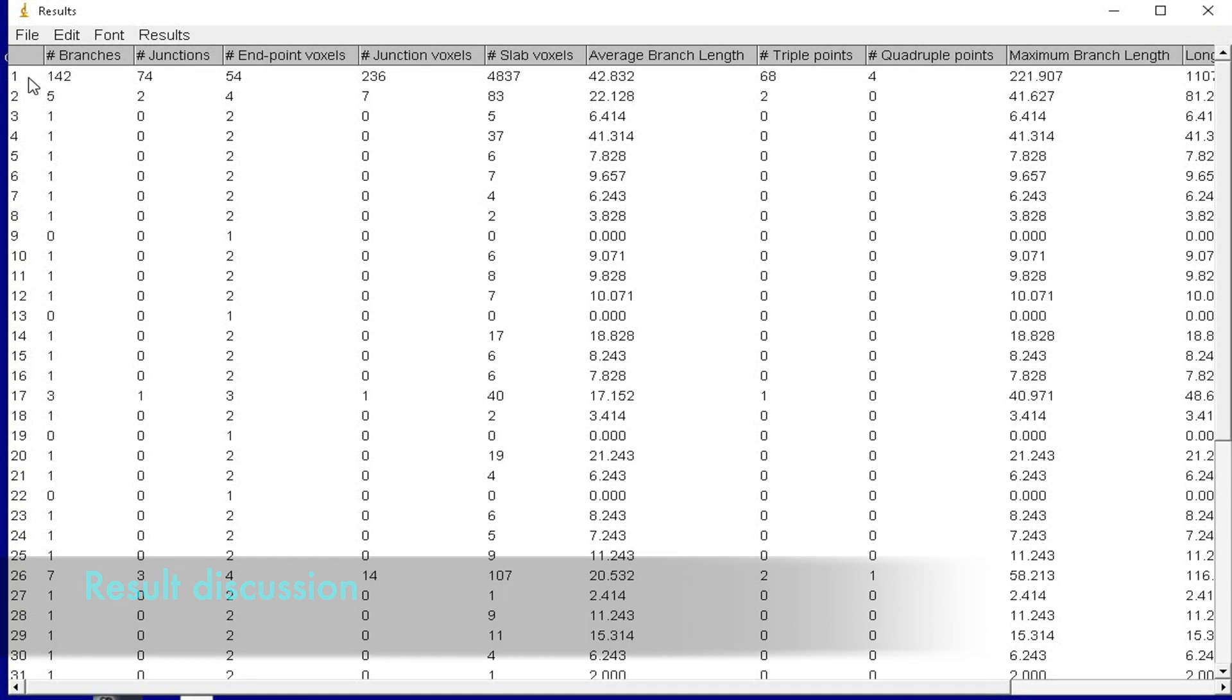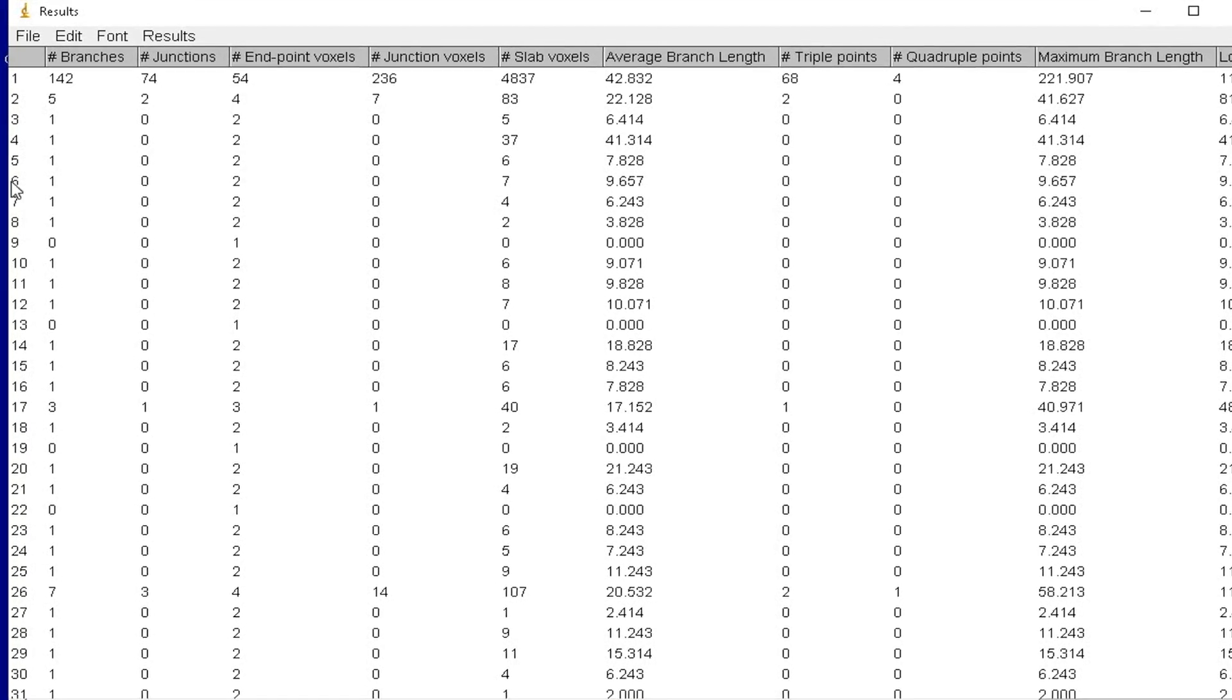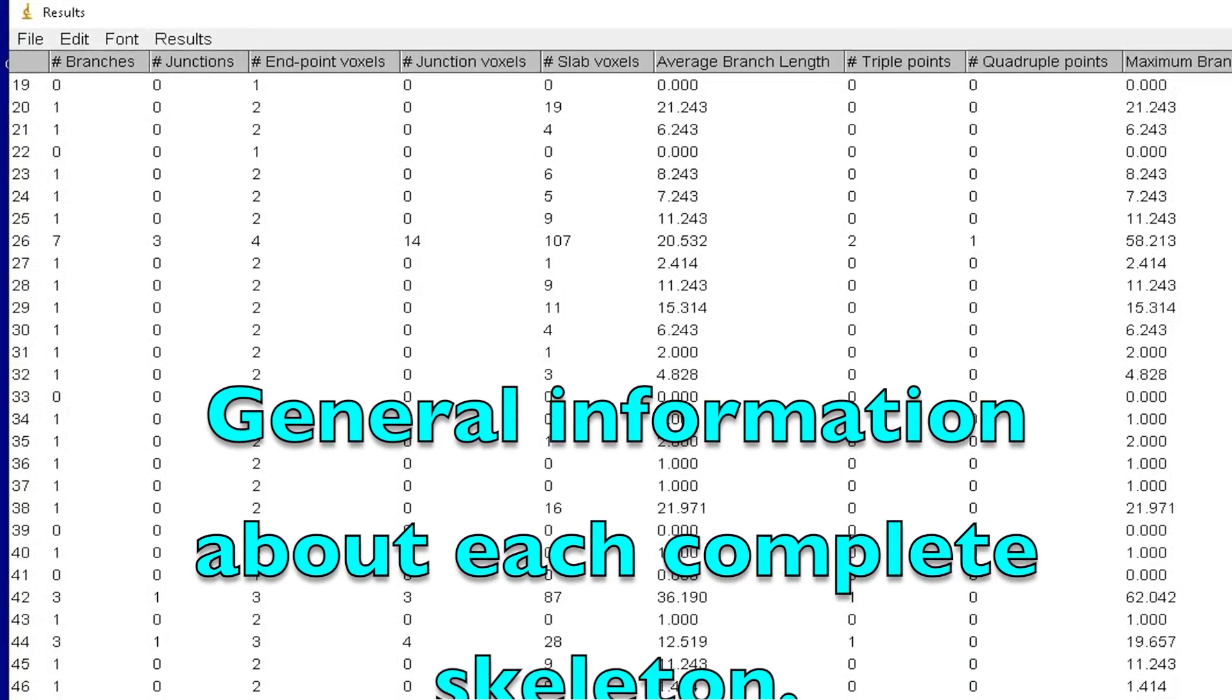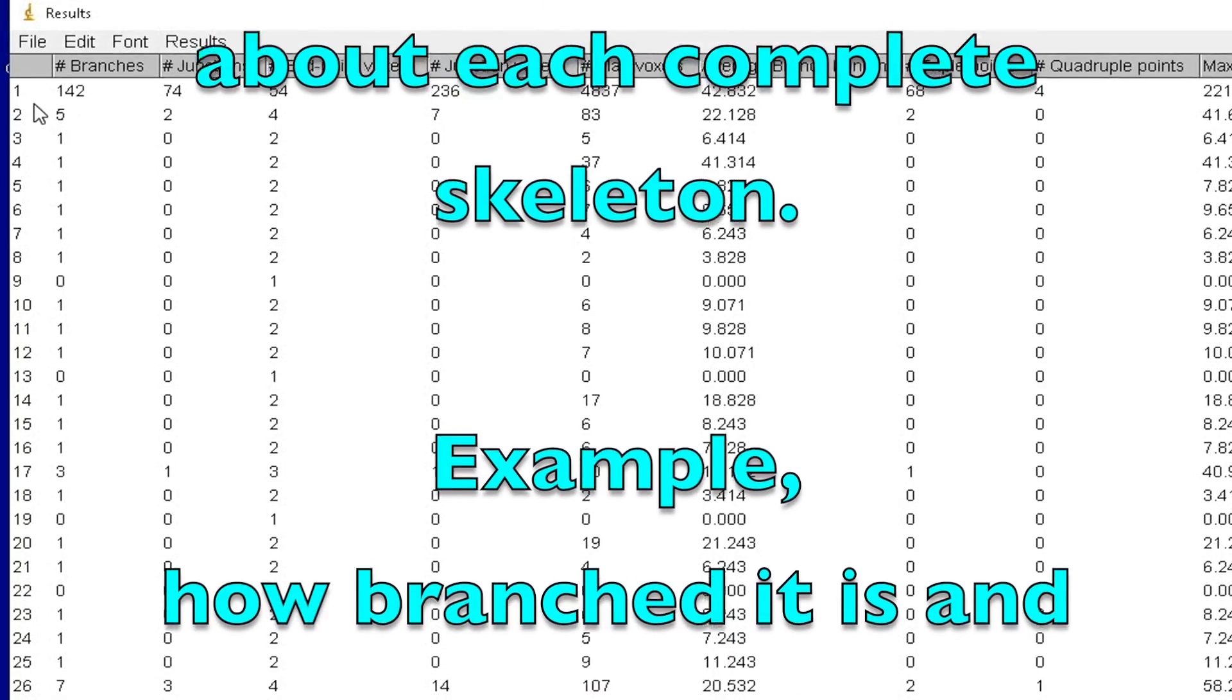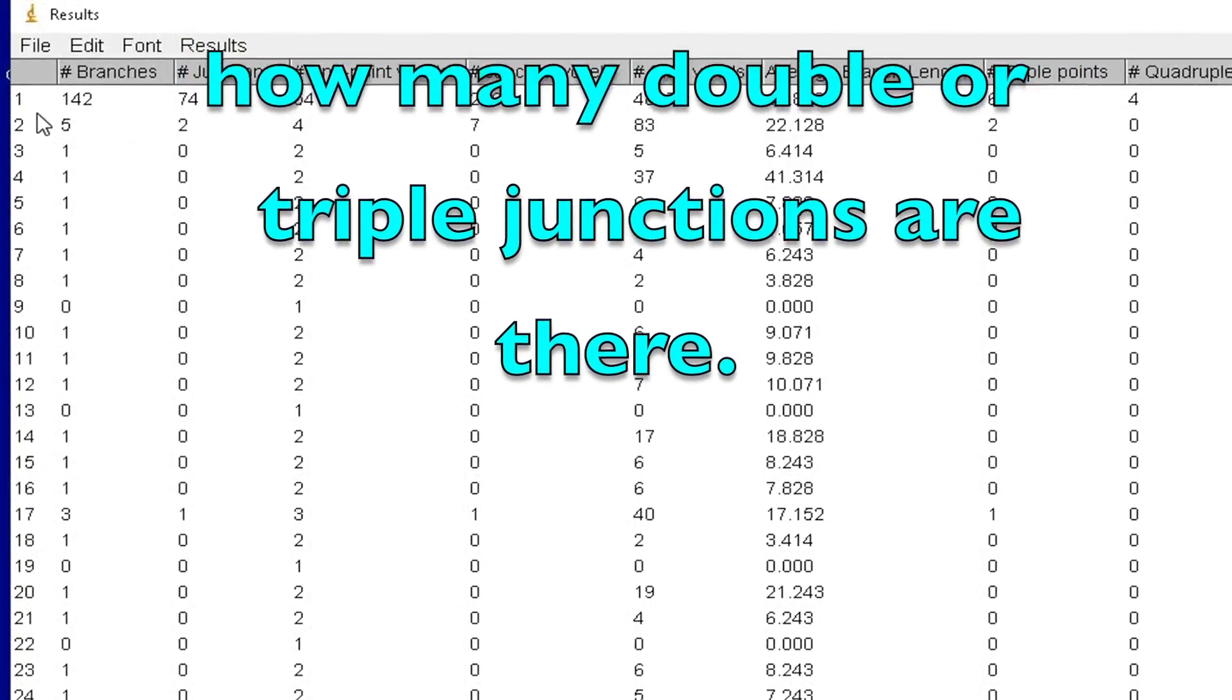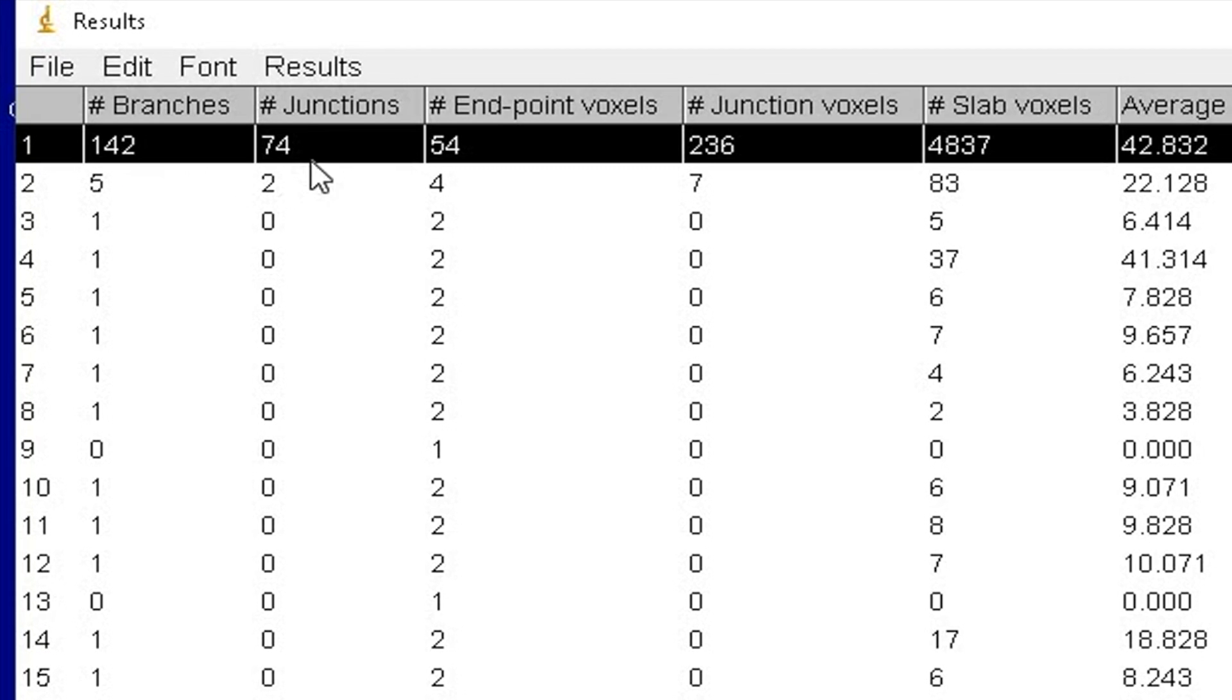Now let us discuss more about the results. The first result window displays information that provides you general information about each complete skeleton in the image. For instance, how branched it is and how many double or triple junctions are there. In the first row, it shows the number of branches as 142.